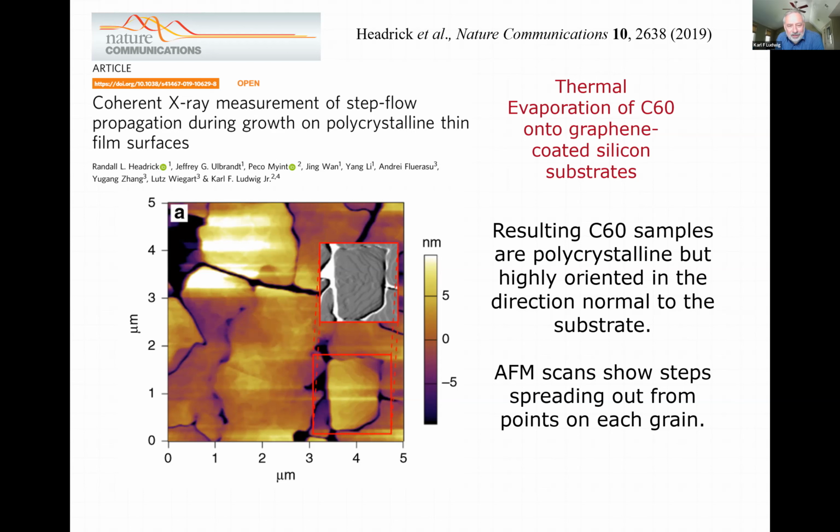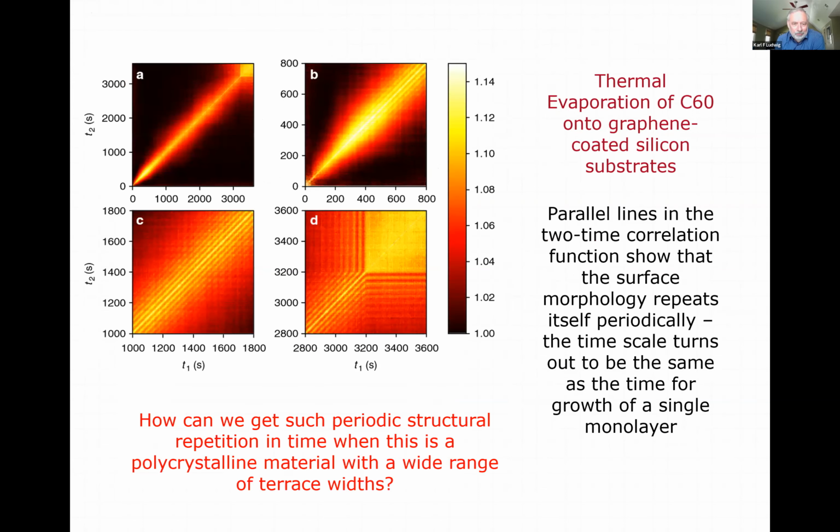And so the morphology you get is not these beautiful single crystals, it's polycrystalline. However, if you look carefully with AFM at each polycrystal, what you can see are terraces. So traditional low coherence experiments would have just averaged over all of this, and we would have been limited in what we could learn.